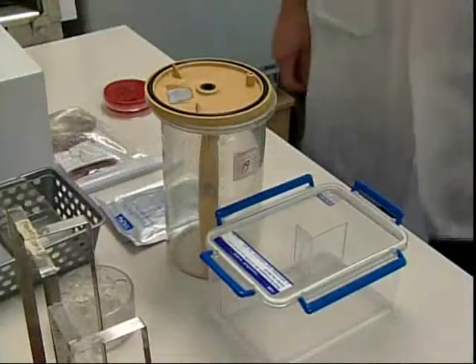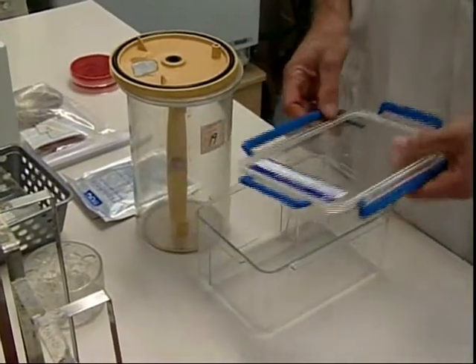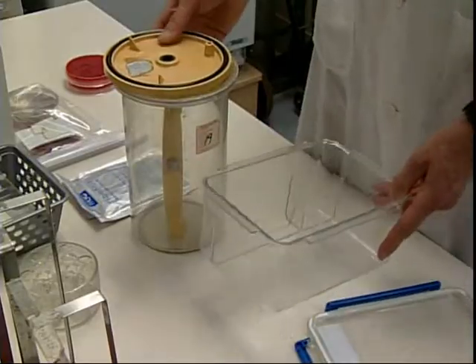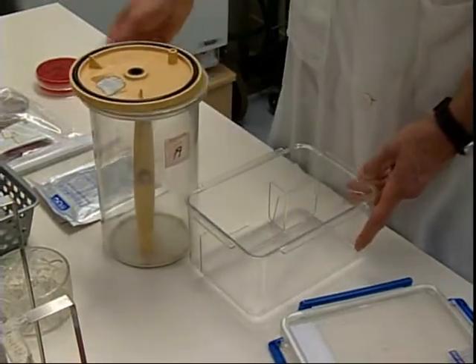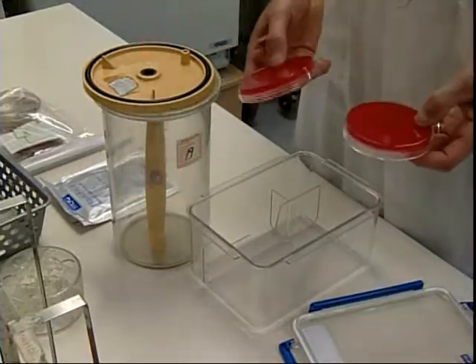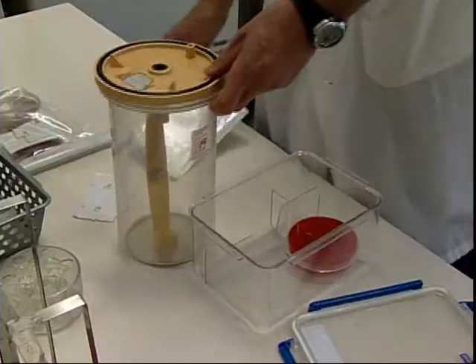Lastly, we want to address the anaerobic requirements of bacteria. Anaerobic bacteria will die in the presence of oxygen. And so we utilize containers such as these two, an anaerobic jar and an anaerobic box, to create anaerobic conditions to enable anaerobic bacteria to grow. And once we've inoculated these plates with the swab, we'll put them into the container.